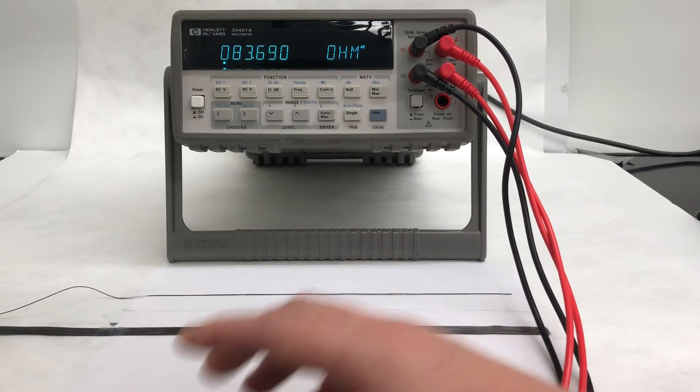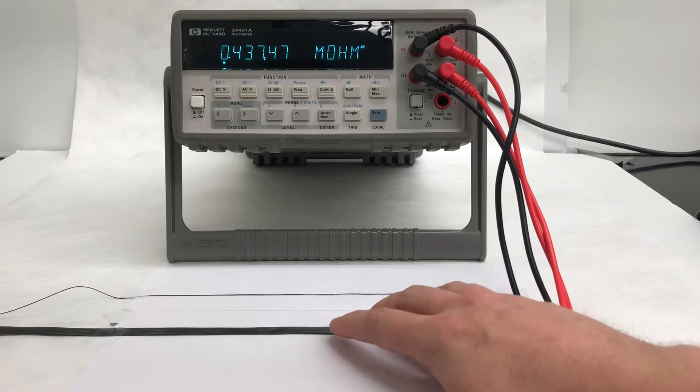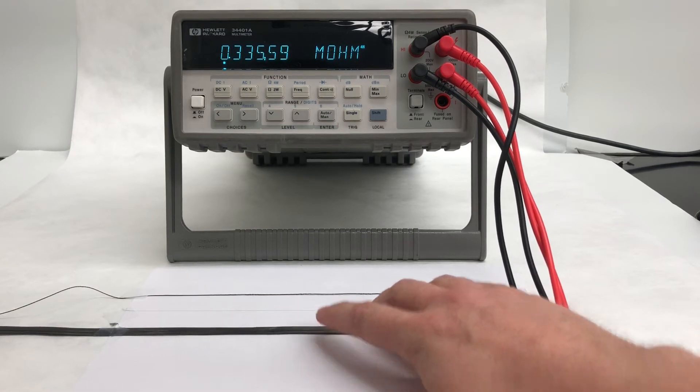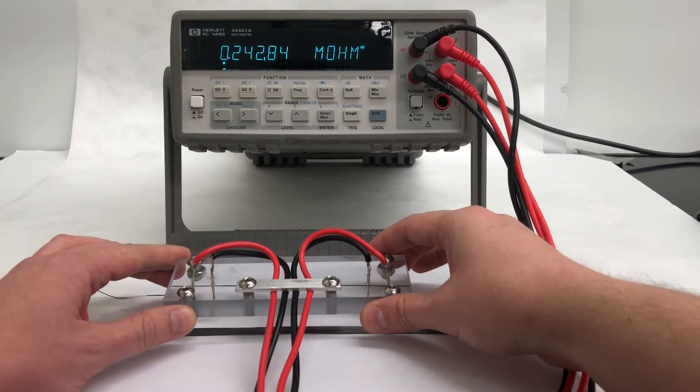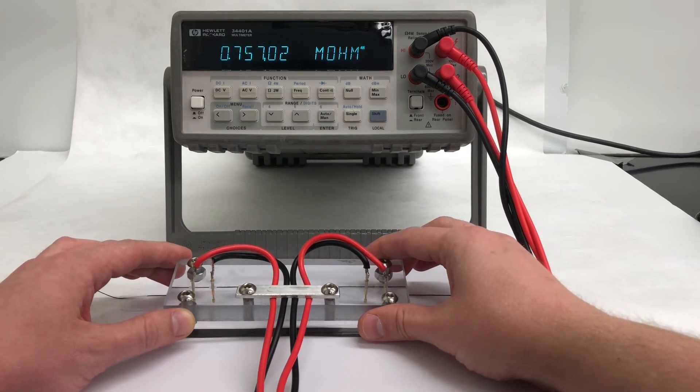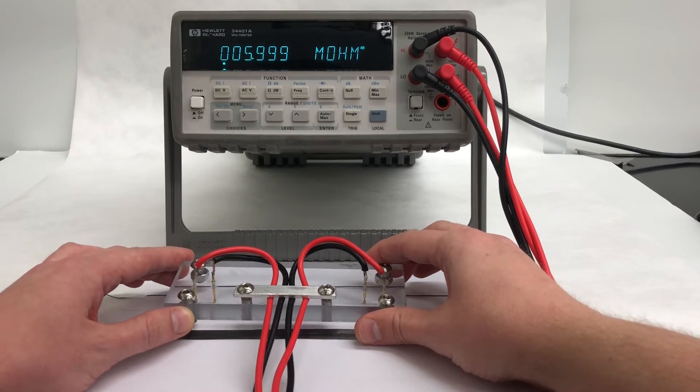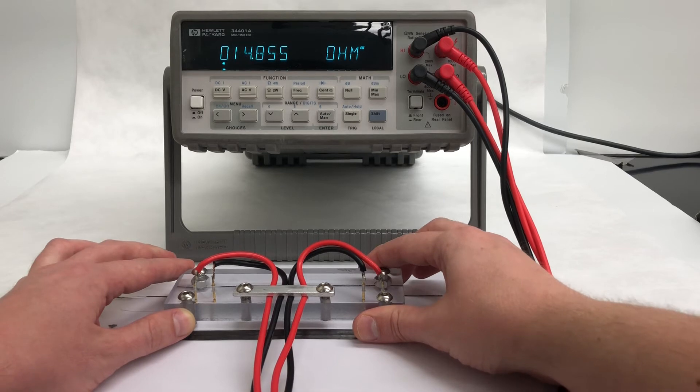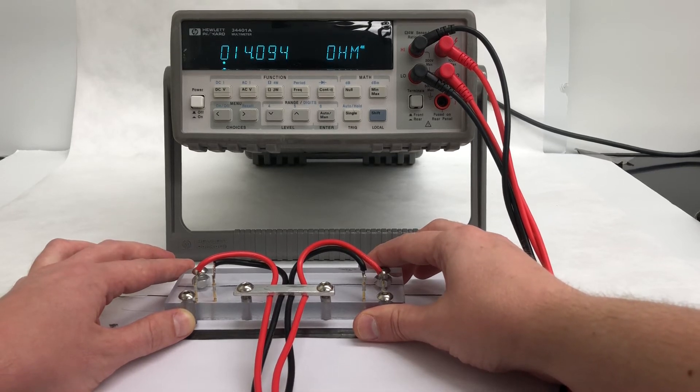This next very thin line here on the paper is one single filament of our carbon nanotube fiber, so that'll have a significantly higher resistance. Okay, 14 ohms.